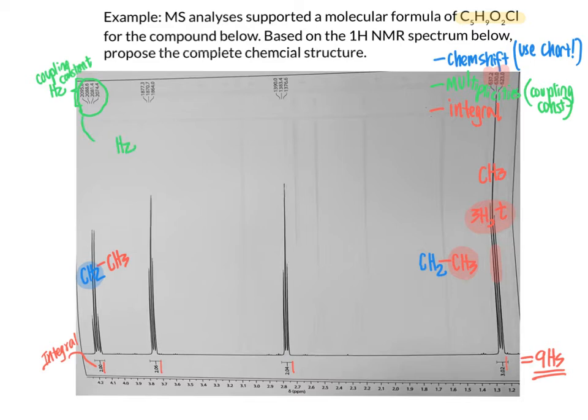And the way that we do that is we can subtract from one another any 2 of these adjacent values. So we can subtract 2095, and I can even get that down to the decimal place, 2095.8 minus 2088.6, which gives us 7.2 Hertz. And we would see a similar value here if we subtracted 2081.4 minus 2074.4. We would get a similar value there within a margin of error.